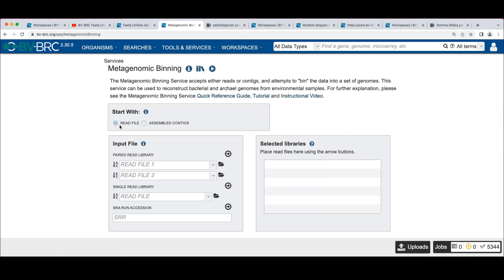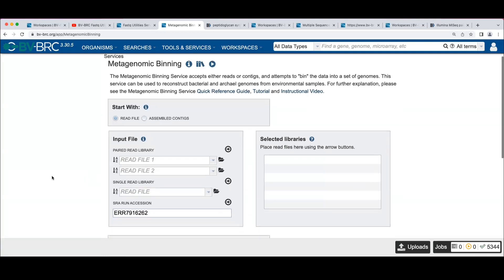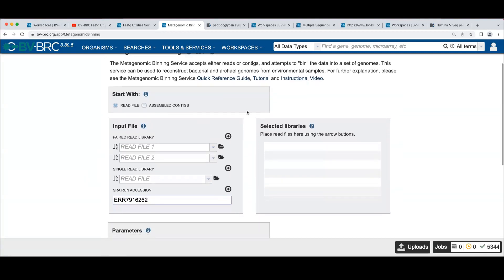We're going to pick our inputs. See if I remember. SRR791262. If you're following on before, this should be easy. We'll just select that and we'll move it into the selected libraries.